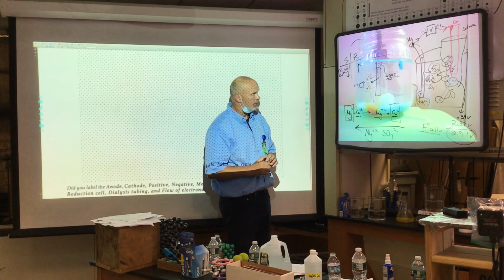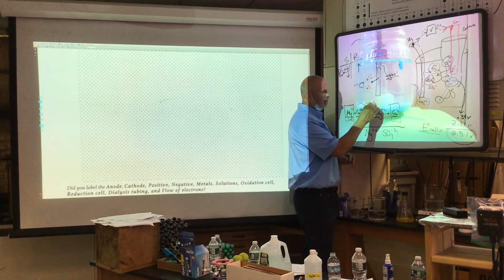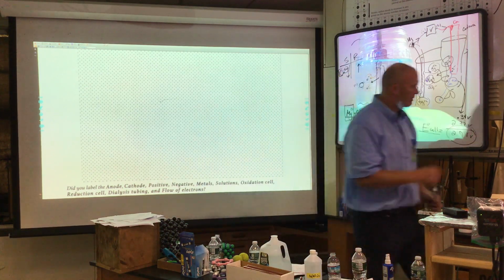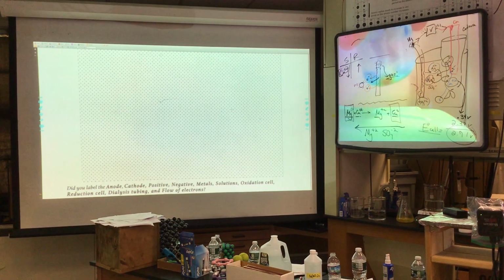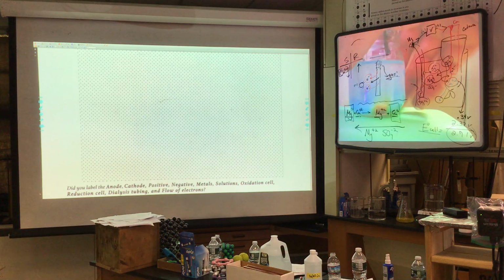Also, there are some other contributing problems in here. You see some precipitates in here, some things settled to the bottom. Looks like there are some blue precipitates. The copper theoretically is bigger, but you got some blue precipitates here.